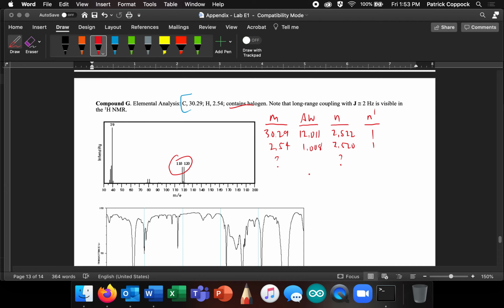So this is going to be CnHnBr. That's what that's going to be. So if n is 1, that's the empirical formula. And I got my point for that. Okay, so let's go here now to find out the molecular formula.